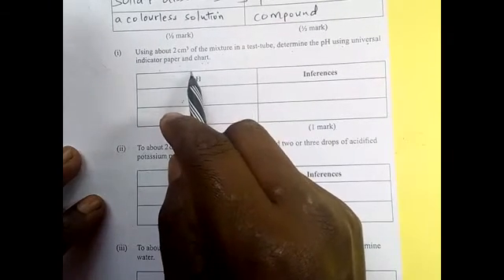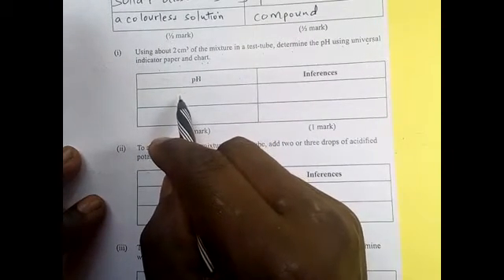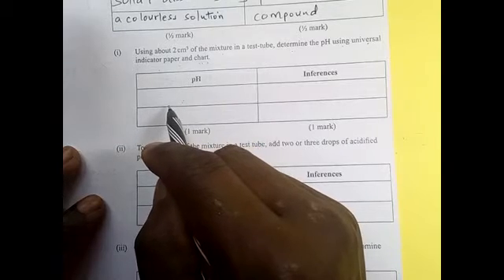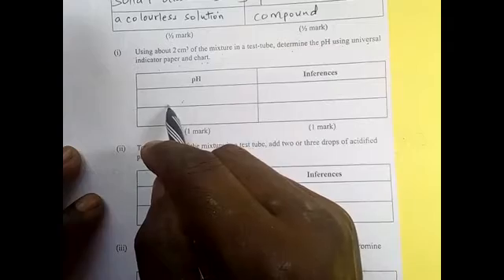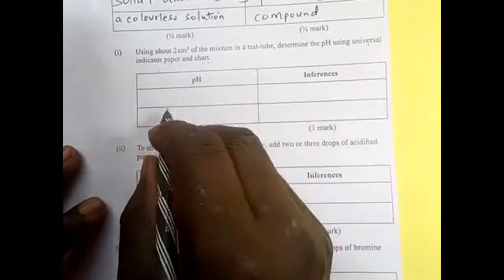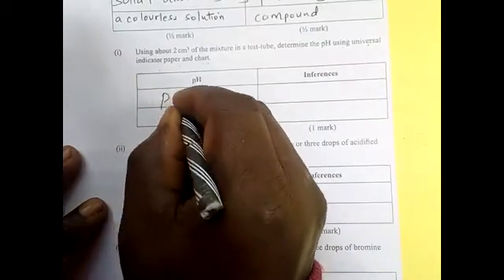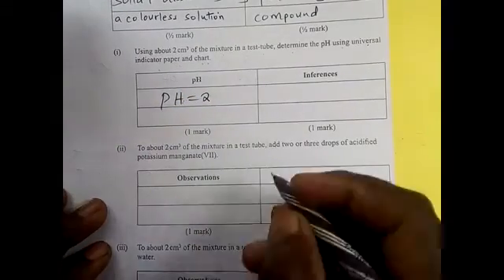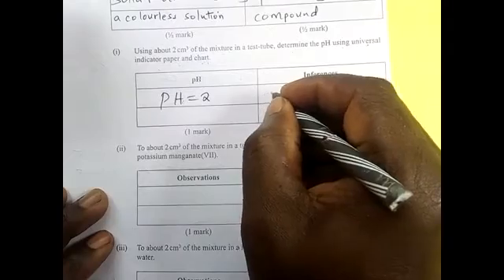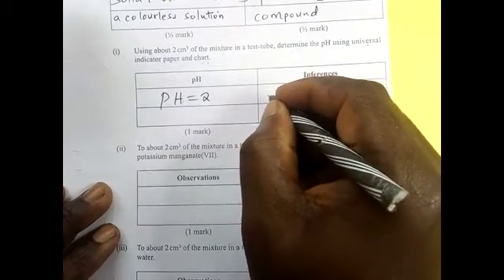If the color is red, then the pH is 1. Yellow means a pH of 6, which is a very weak acid. Green, pH of 7, which is neutral. For this one, the pH was 2. So if the pH is 2, it simply means that the solid was an acid, strongly acidic.